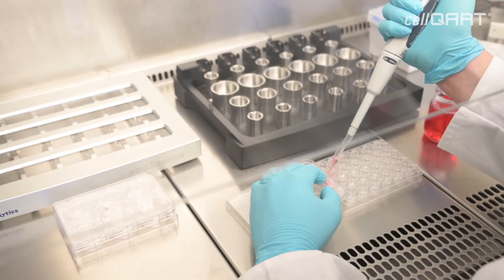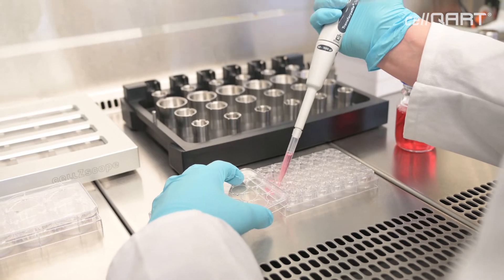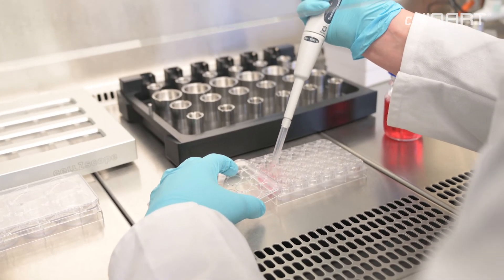My name is Tobias Naber and I'm currently working on my PhD thesis here in the lab of Professor Wegener in Regensburg. During my PhD thesis we have a variety of different applications for the CellScope device, where we are trying to monitor fast changes in the epithelial barrier function online.